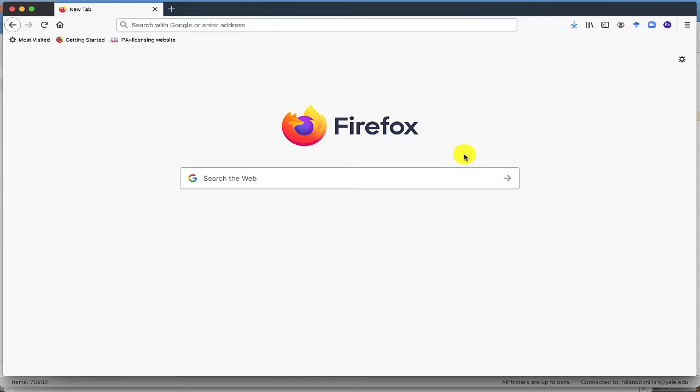In this video, I am going to show you how to retrieve UTR promoter and other sequences of a gene using the UCSC Genome Browser.